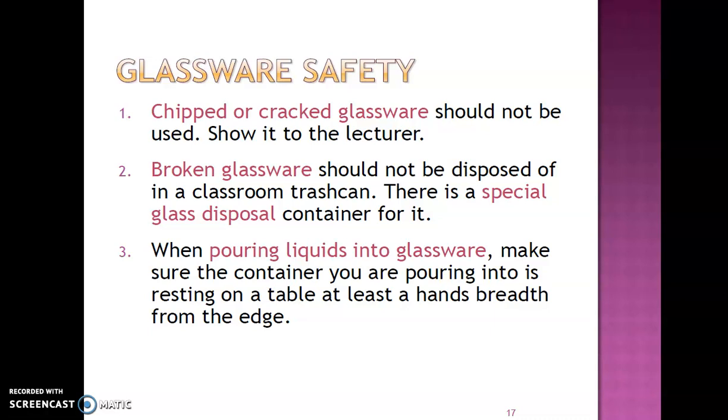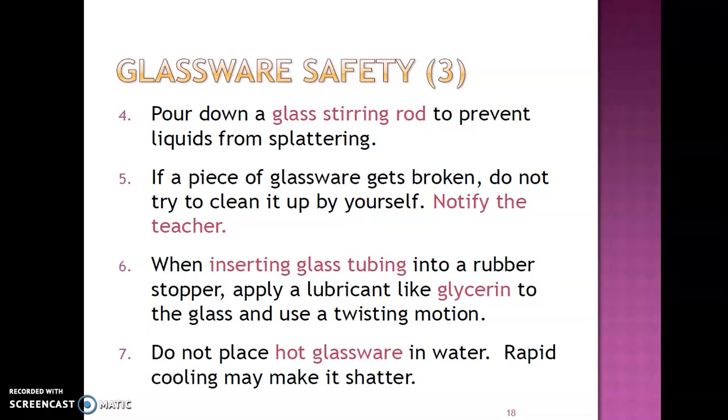When pouring liquids into glassware, make sure the container you are pouring into is resting on a table at least a hand breadth from the edge. Pour down a glass stirring rod to prevent liquids from spattering. If a piece of glassware gets broken, do not try to clean it up by yourself. Notify the teacher or instructor.